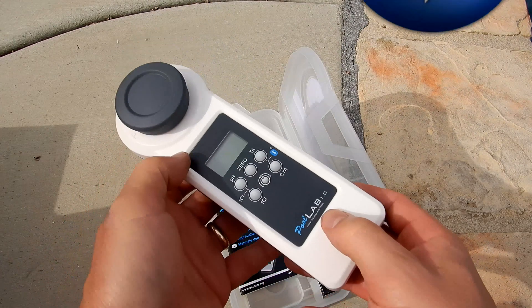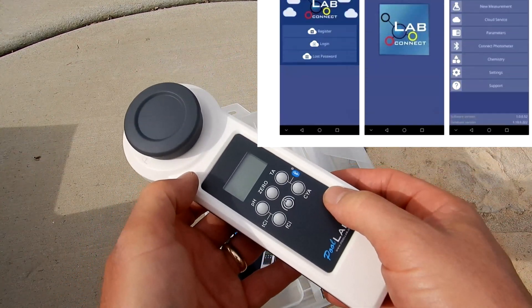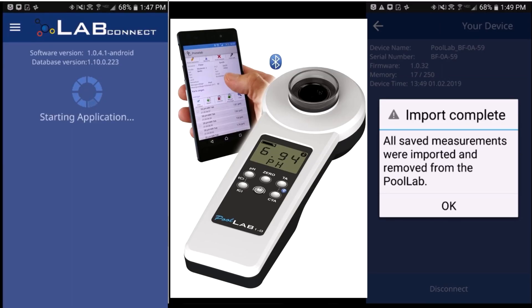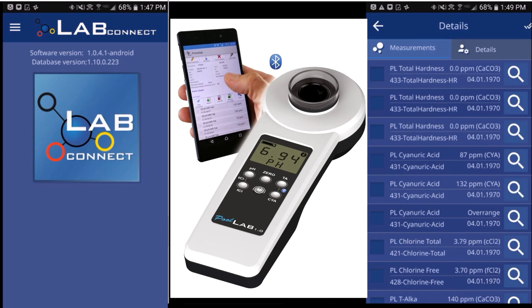The PoolLab 1.0 is also Bluetooth compatible, so you're able to send your testing results over to your phone or device. This is great if you're in the service industry and want to save and email readings to your clients. The LabConnect app is very user friendly — once you install it, it will connect directly to the PoolLab 1.0.